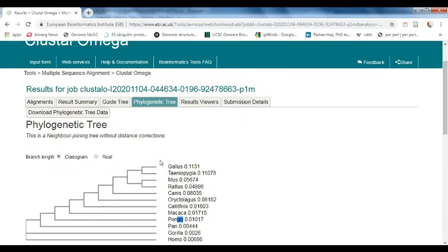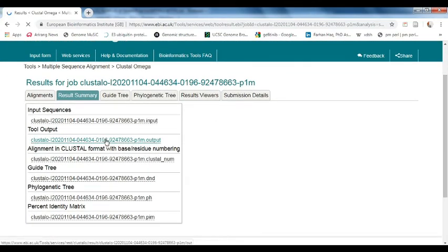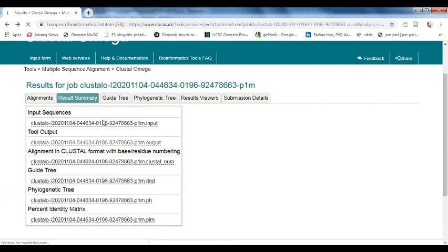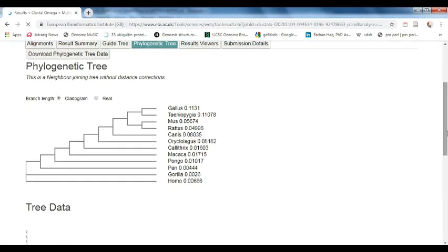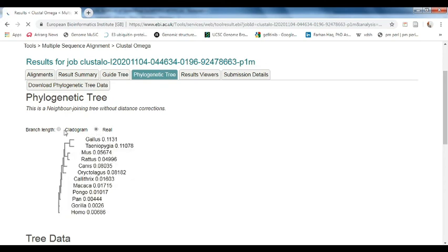This helps you understand how those sequences are related to each other. Using the tool output, you can also see the pairwise distance calculation for each sequence compared to all other sequences. This tutorial covered multiple sequence alignment — how to identify conserved and non-conserved sites — and by clicking the phylogenetic tree you get a default tree showing how sequences are related. This is based on actual distance between species, which will be discussed further in later phylogenetic analysis sessions.